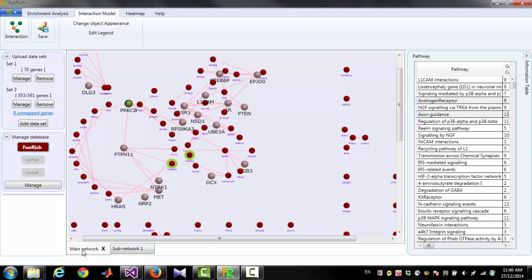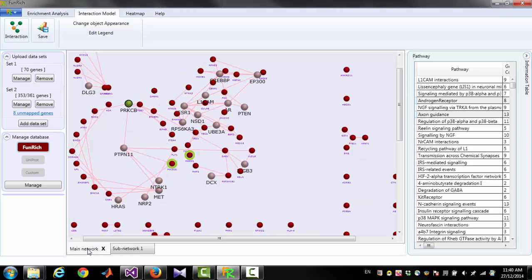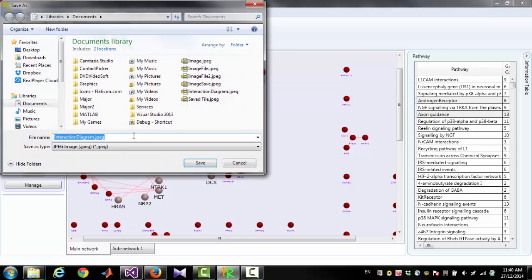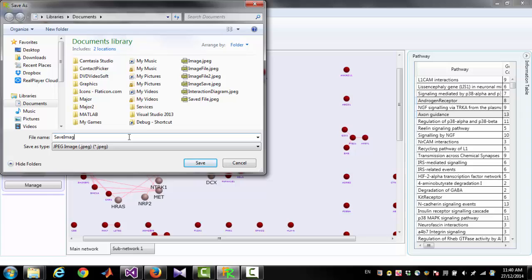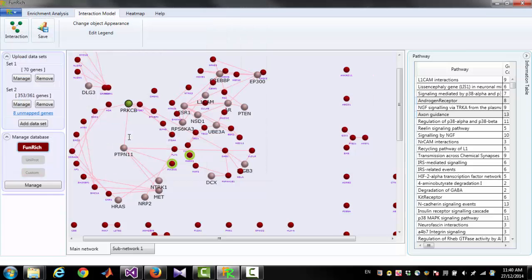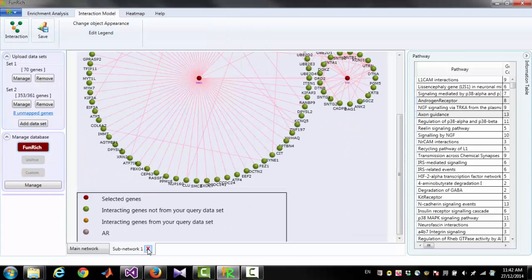To save the main network or sub-network as an image file, you have to click the Save button and give a file name. You can also close those networks by clicking the cross button.